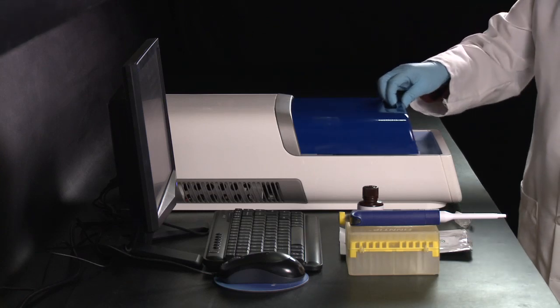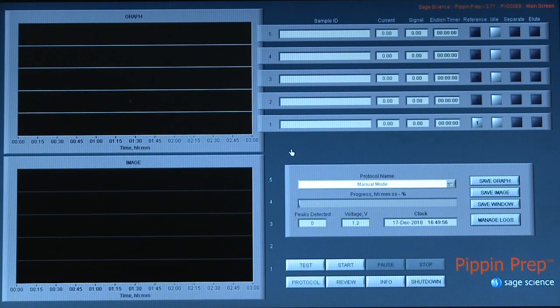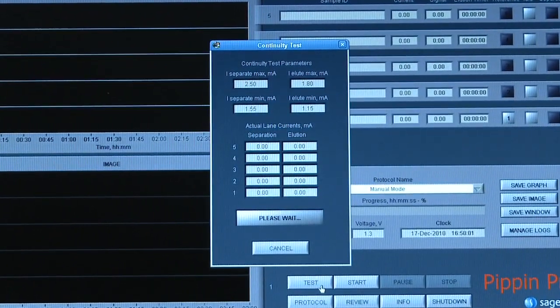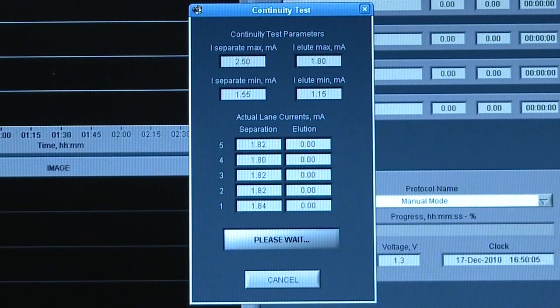Then close the lid. Next, run a current test by pressing the Test button. The testing routine will automatically launch. If the test gives a pass result, the cassette is ready for use.